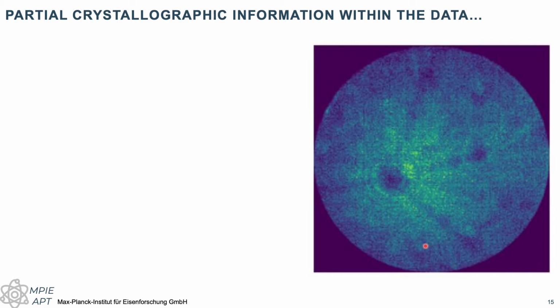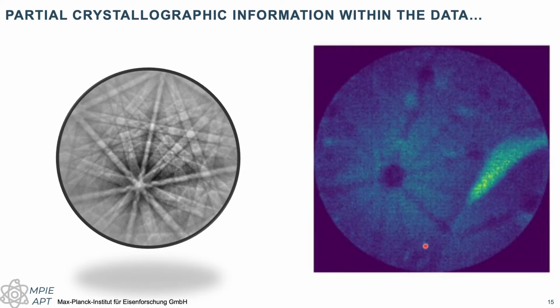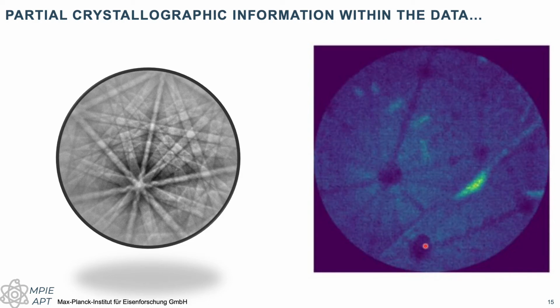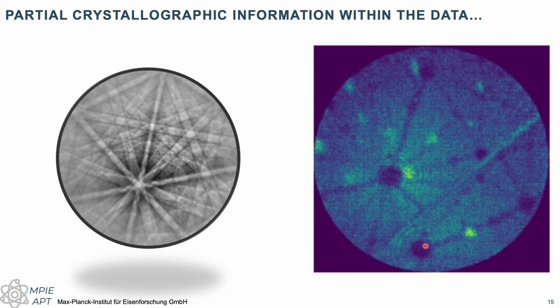This type of patterning is not completely dissimilar to what we are maybe more used to seeing, the Kikuchi diffraction lines that we find in electron backscatter diffraction. The origin is the same somehow, in that we are looking at crystals, but that is diffraction, so it's in reciprocal space, whereas this is all in real space and is caused by the morphology and the faceting of the specimen surface and the resulting trajectory aberrations, which will be covered in a separate lecture.